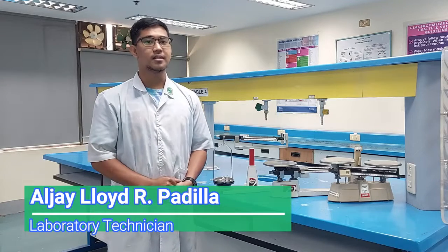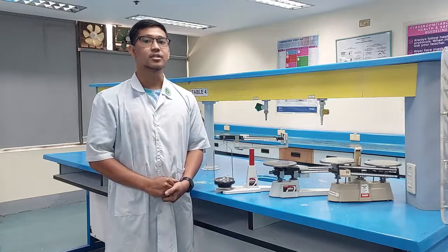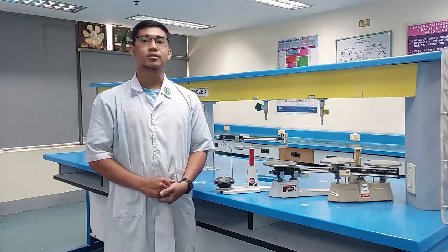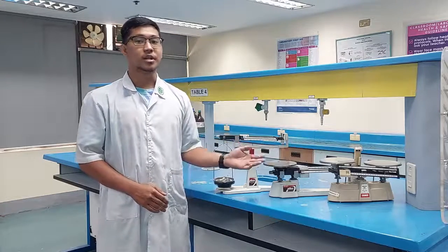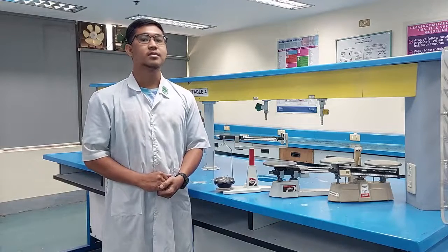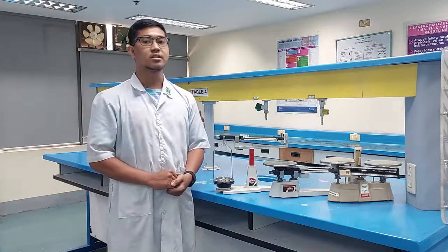The measurement of mass in the laboratory is performed using balances. For most everyday objects, scientists use a balance to obtain an object's mass. A balance compares an object with a known mass to the object in question. The common balances utilized in the lab are the single, double, triple, and 4-beam or centigram balances. Analytical balances are used to weigh defined amounts of substances. The standard unit of measure for mass is based on the metric system and is typically denoted as kilograms or grams.